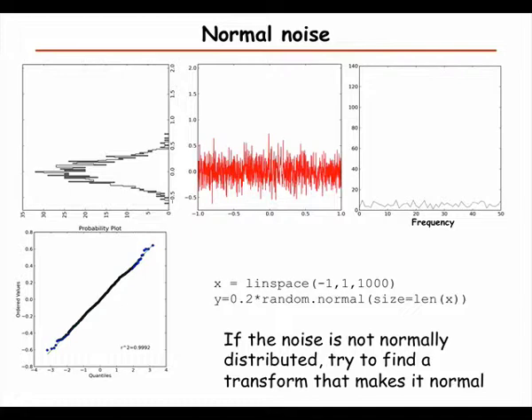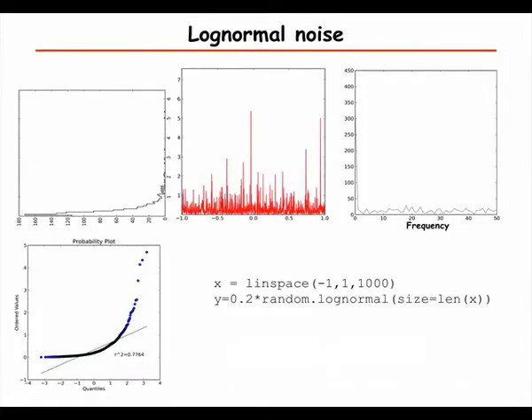So usually it's very much easier to work with data if we can transform the noise to normal. And sometimes this is easy, and sometimes it's not so easy to do. But it's always worth trying, because then we have much better tools to deal with it.